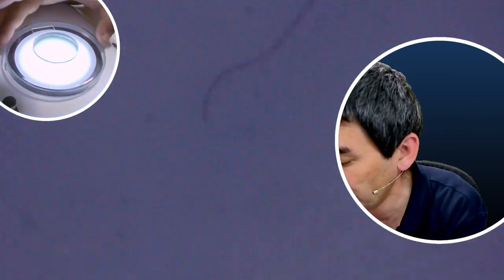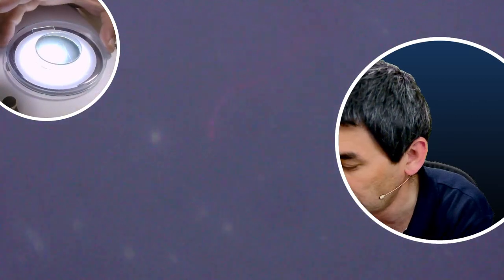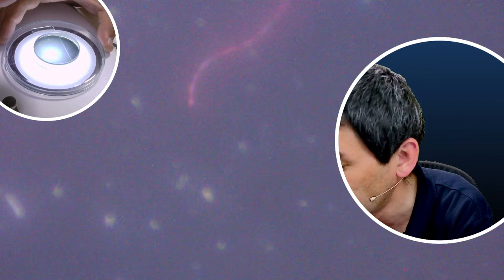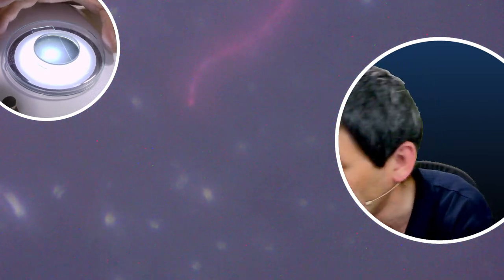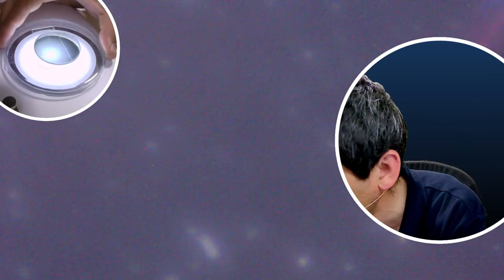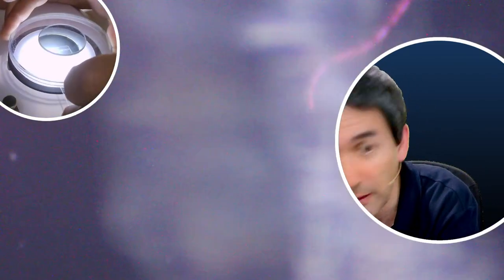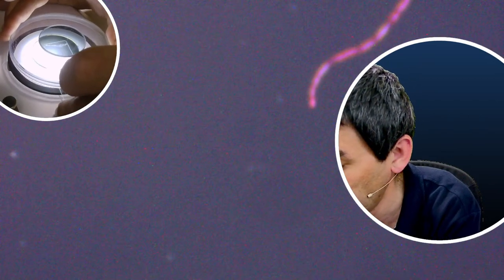I'm going to now rotate everything here until it becomes dark. Okay, now everything is pretty dark. We are able to see a couple of dust fibers. And let's hope that it will start to form some crystals. Maybe it already starts to form. Look here on the side, we already have some forming.